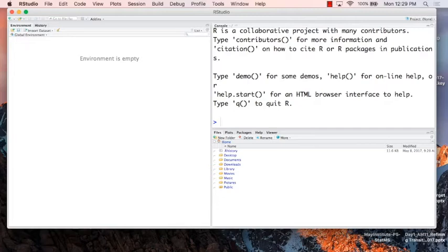As we mentioned, we have several channels to use MSstats, and now we have a lot of functionality and try to expand as much as we can across all the spectral tools. Today, with ABRF1, there are several inputs from different spectral tools, and we're going to repeat the same workflow with a different data set and spectral tool and compare. You can see some differences. We are going to use the DDA data set because it helps us see our contribution to the protein quantification. However, it is also fine for SRM and DIA cases.